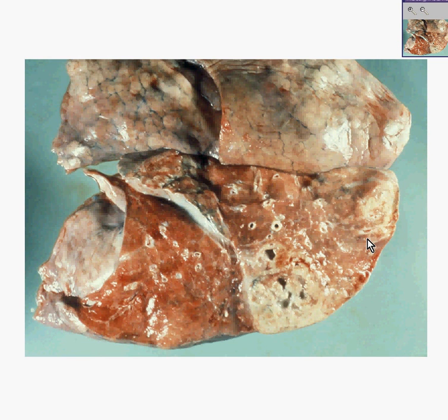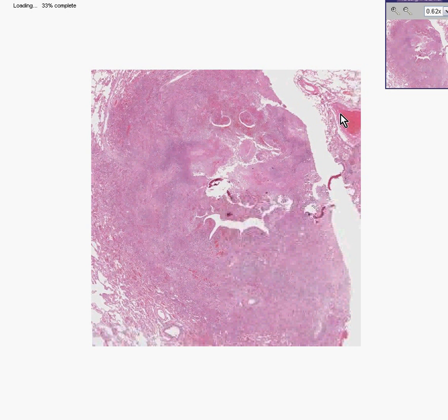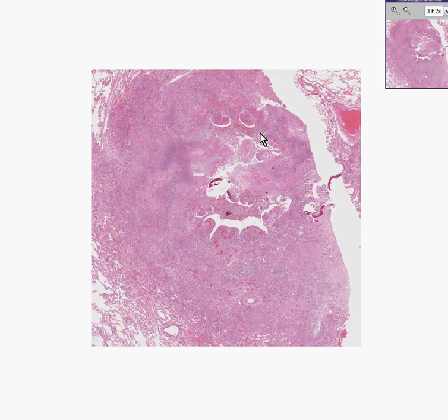And here's another cut surface. Notice in this portion of the cut surface there is a consolidated yellowish area. If you were to take a microscopic view through this area, you would see that it looks like a large granuloma — and why is that? It's because it is a large granuloma. Here is some normal lung out at the periphery.